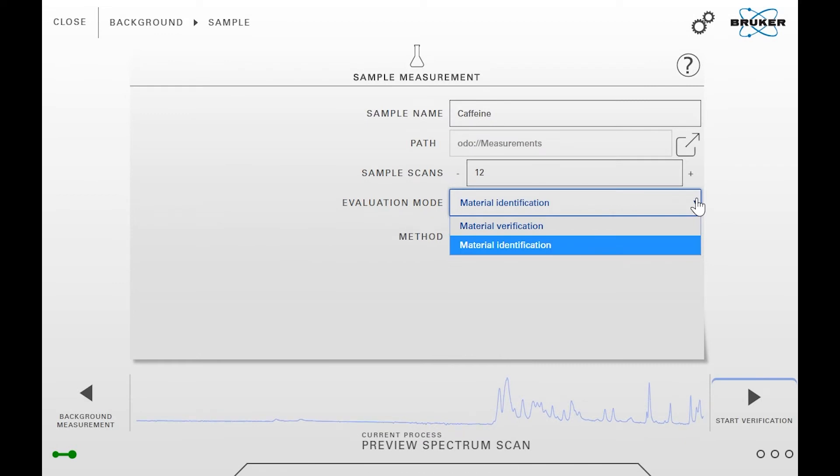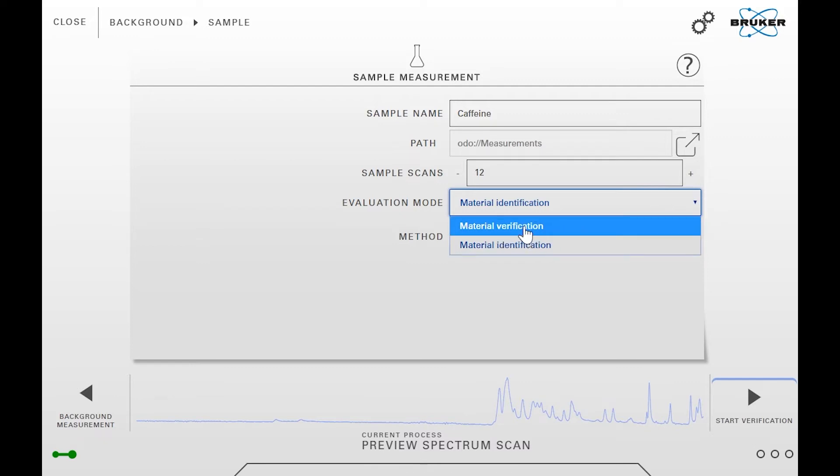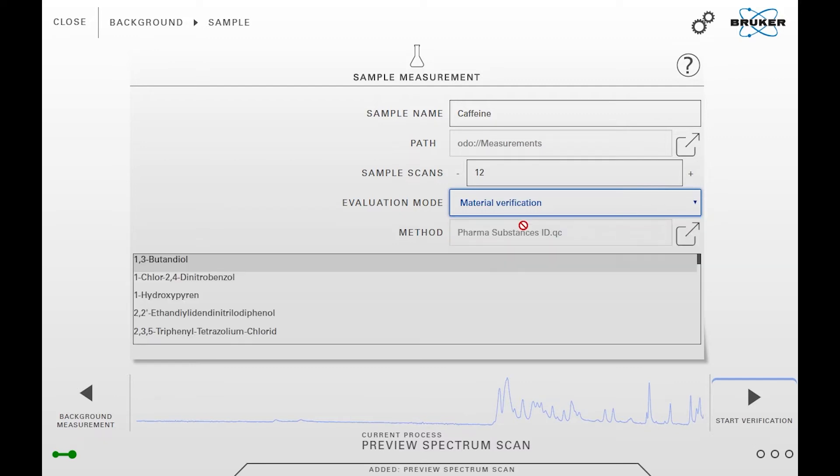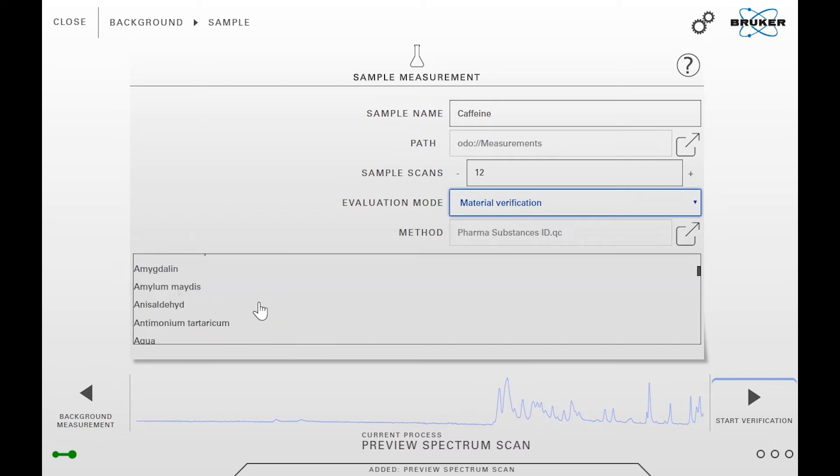For our demonstration we will select material verification. It requires you to select a substance in advance and has the benefit that you will only get a green result when the expected substance was actually found. We will select caffeine as the expected sample.